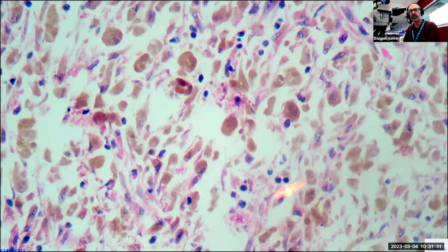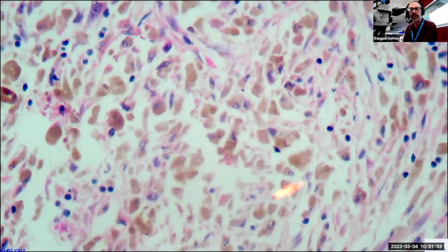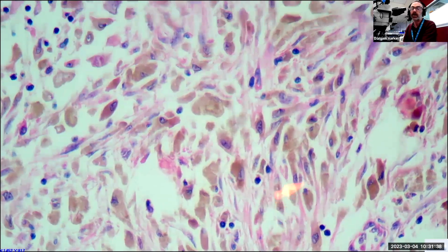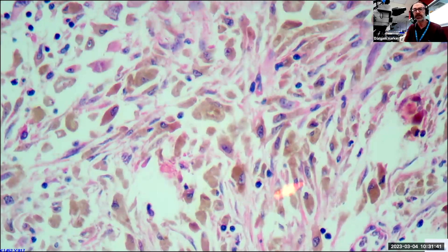If your goal was to completely remove it from the section, for example, there could be circumstances under which, for example, immunohistochemistry, if you're using a brown chromogen like DAB on something like retina, which is something we've done in the past, because you have melanin pigment within the retinal pigmented epithelium, you would want to remove that brown color from the section prior to then performing immunohistochemistry using DAB.